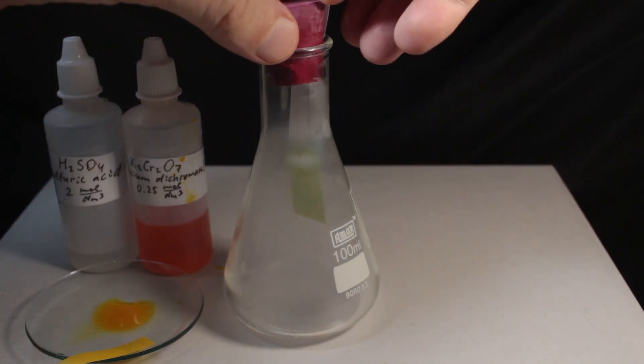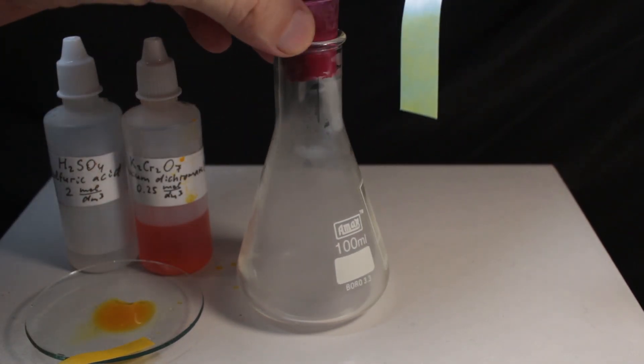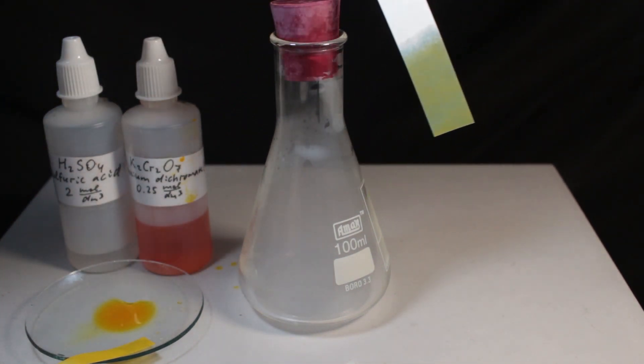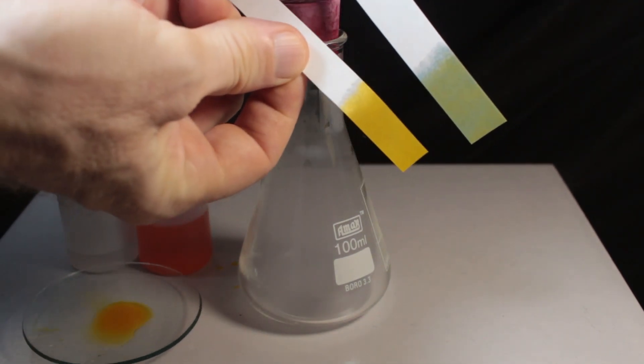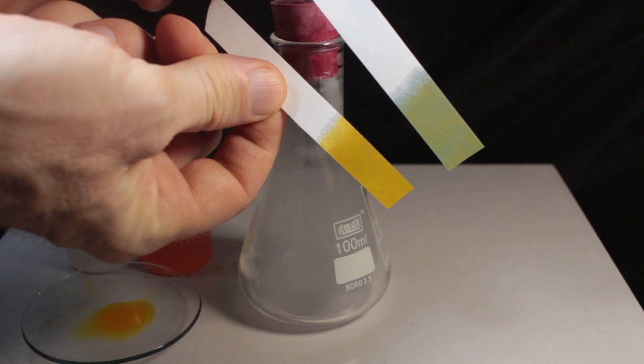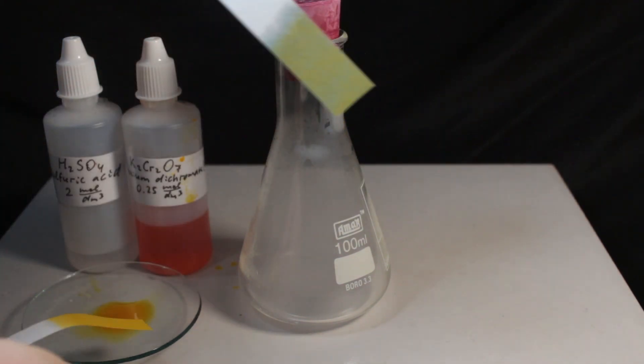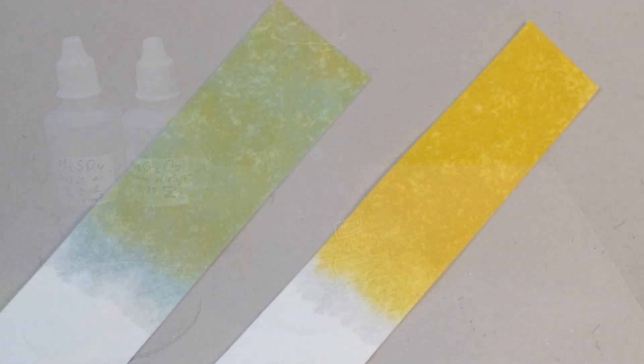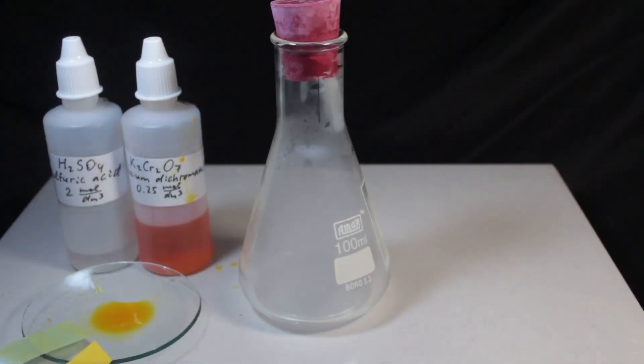Color changes virtually immediately from orange into green. That's the test for sulfur dioxide. Acidified potassium dichromate paper turning from orange to green.